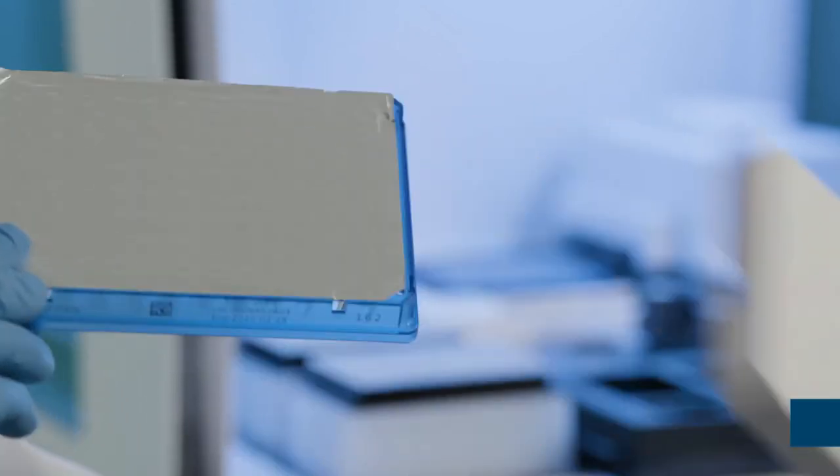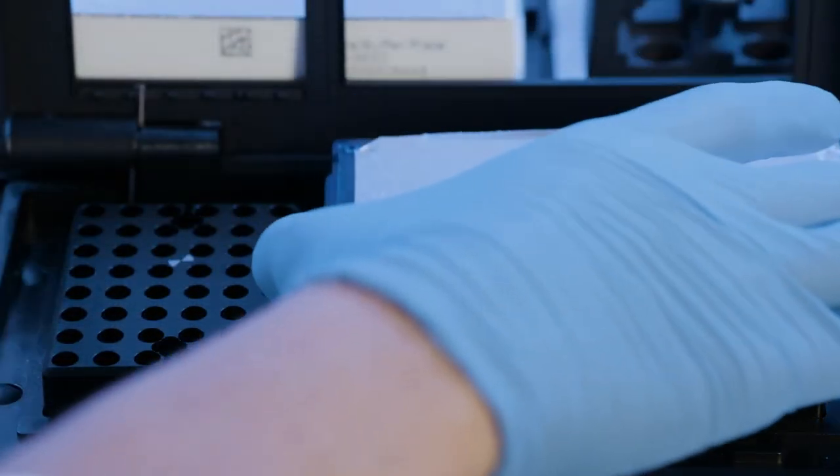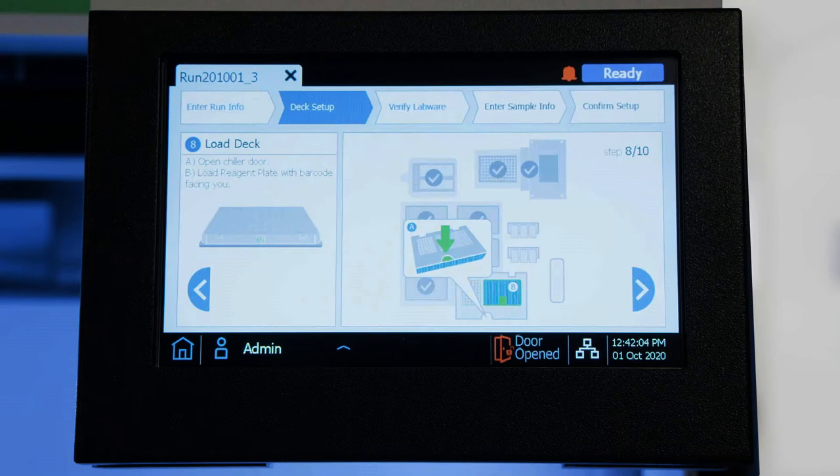The barcode needs to be facing towards the front, and you put it into the unit in a similar fashion to the way you loaded the empty PCR plate.